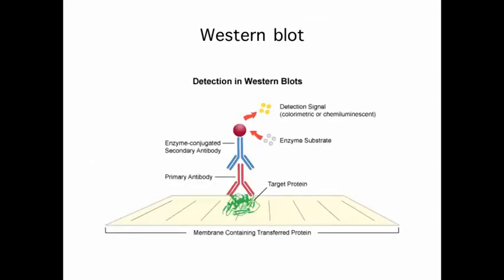So here's how it's going to look. The proteins are all transferred to a PVDF membrane. So something called a sandwich is made, where you put the PVDF membrane against your gel, you hold them together in a little holder, and then you run a current across it, causing all of the proteins to transfer to this very thin membrane and out of the polyacrylamide gel. And then you have a surface with all of the proteins that are now fixed to this PVDF membrane.